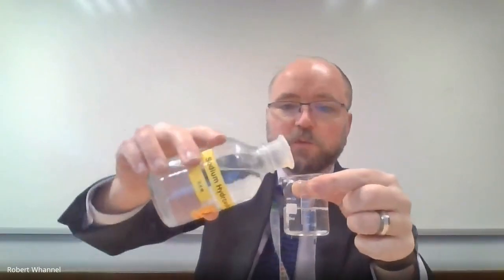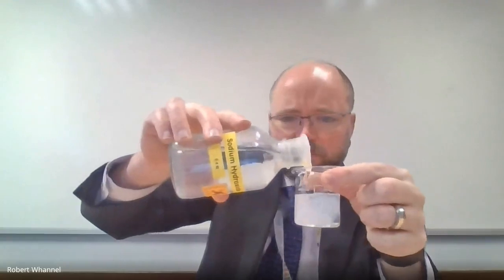So what I've got is a solution, and there's a mystery metal ion in it. And what you would do, practical, you take some sodium hydroxide, and you add it. And as you can see, I hope, look at that. What it will look like on your screen is that it's gone cloudy. Now, there's a new word for you. It is precipitate. And what that means, this cloudiness, is because there's a solid forming in the solution.